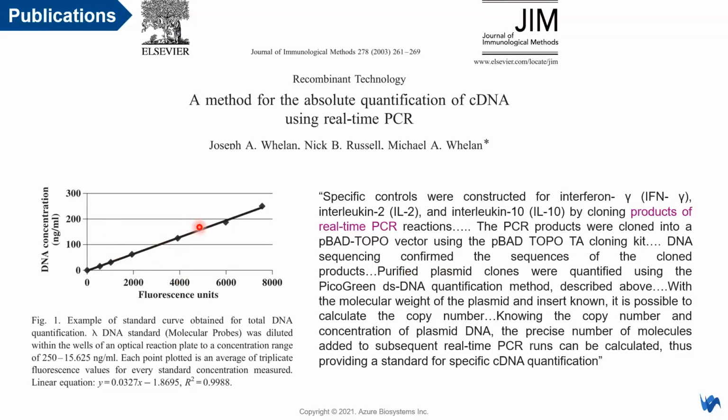So this is how you make sure that both of them have the same efficiency: by matching your unknown sample, what you want to detect from the unknown sample, and the sample type that you use to generate the standard curve. Both of them must match each other, so you know that you are safe to extrapolate the data on the standard curve by itself.